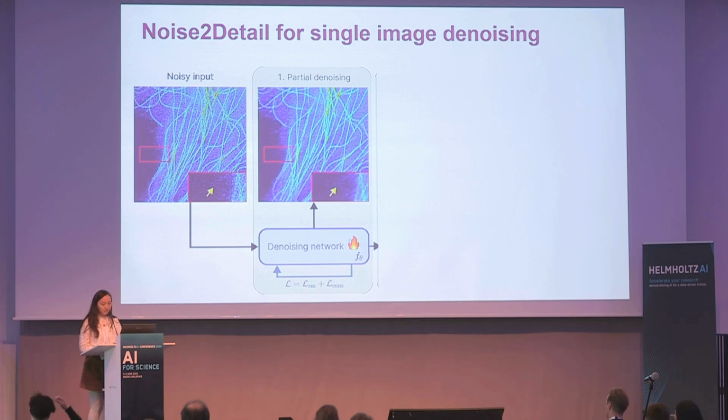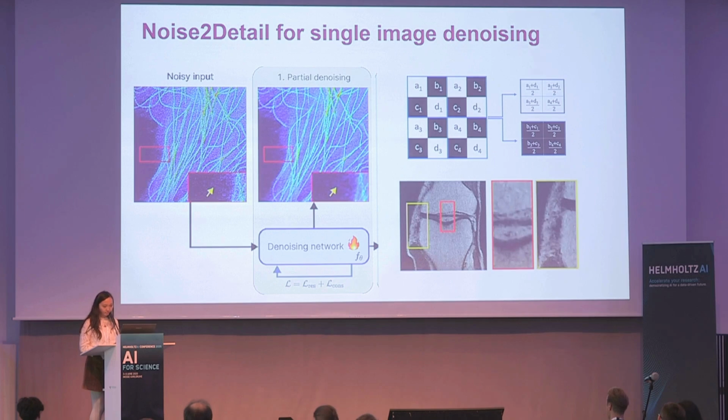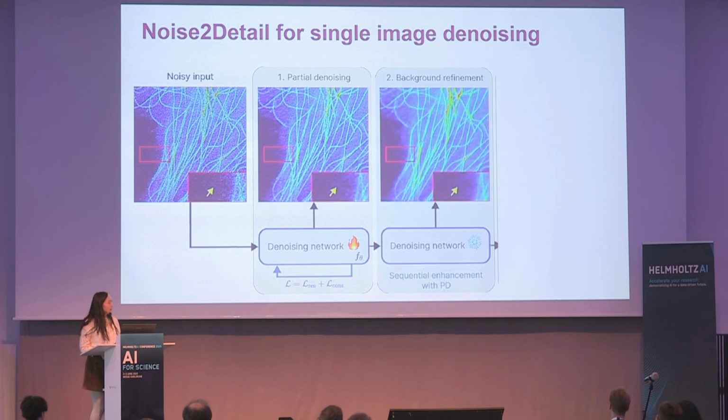this single-shot denoising algorithm will work perfectly if your noise is strictly Gaussian white noise. But for microscope settings, this is not the case. We don't always have Gaussian noise, we have Poisson noise, and sometimes it's also correlated with the foreground. That creates a correlation in the background, which creates this kind of pattern after denoising. That also shows in the original CVPR paper, and you also see the background in this medical imaging denoising. So we have to do something.